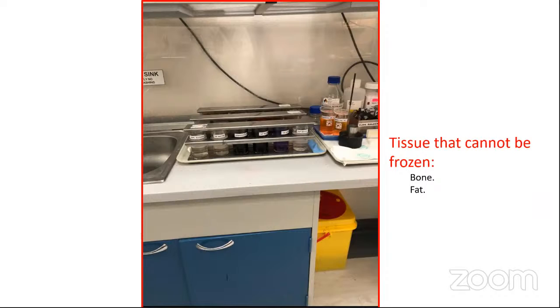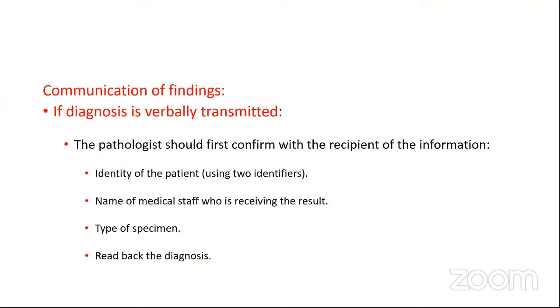After we get to the slide, we look under the microscope and make a diagnosis, then we deliver the diagnosis to the OR. The diagnosis could be written and sent to the OR, or verbally communicated and transmitted to the medical staff in the operating room. The pathologist should first confirm the following points with the recipient of the information. We have to have 2 identifiers of the patient, such as record number or date of birth.